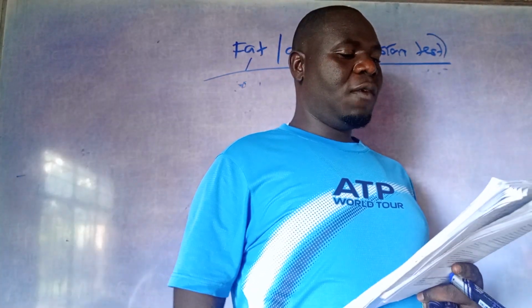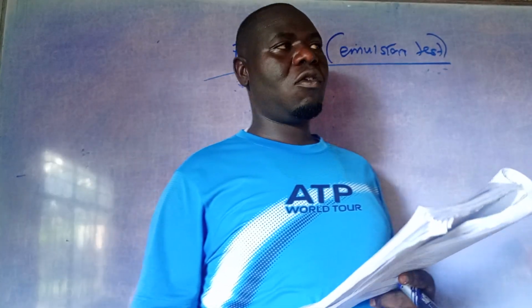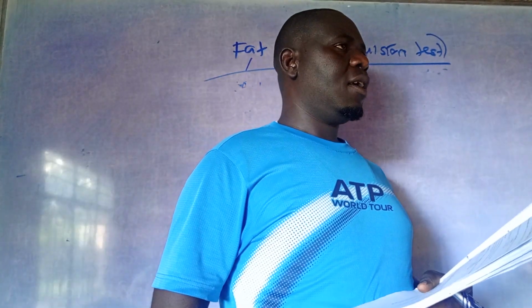So if an emulsion is formed or the solution turns cloudy, then fats or oils are present. This is the test for lipids.